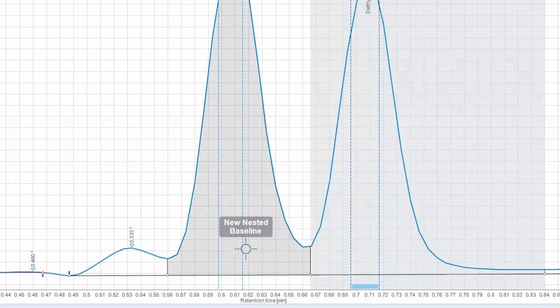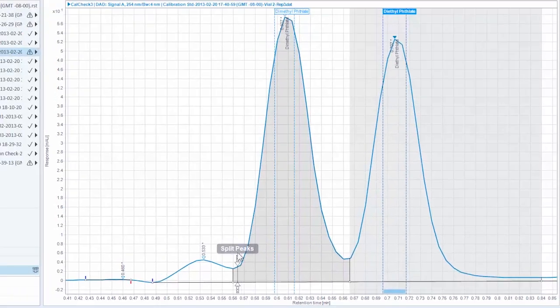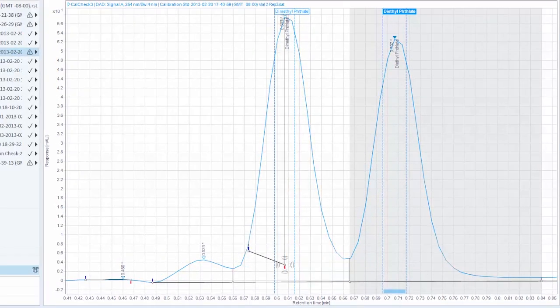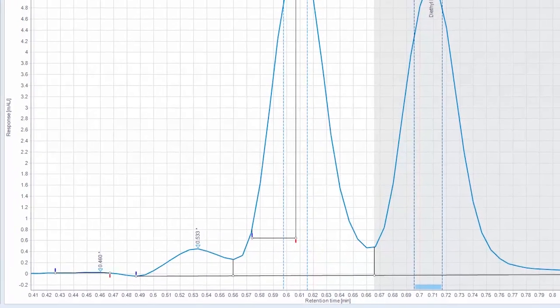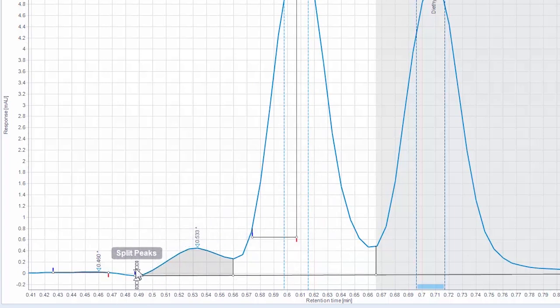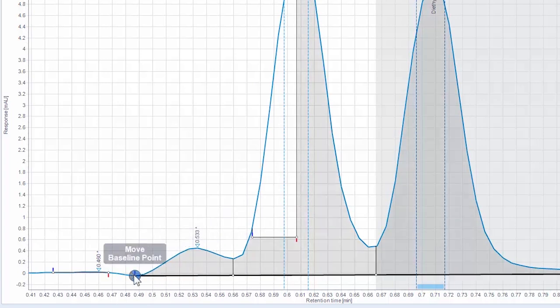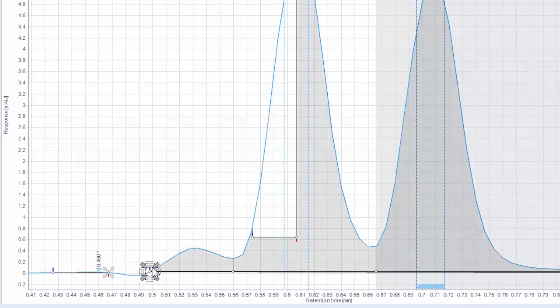Create a new nested baseline by hovering inside an existing peak and clicking and dragging. Move existing baseline endpoints by clicking and dragging them.